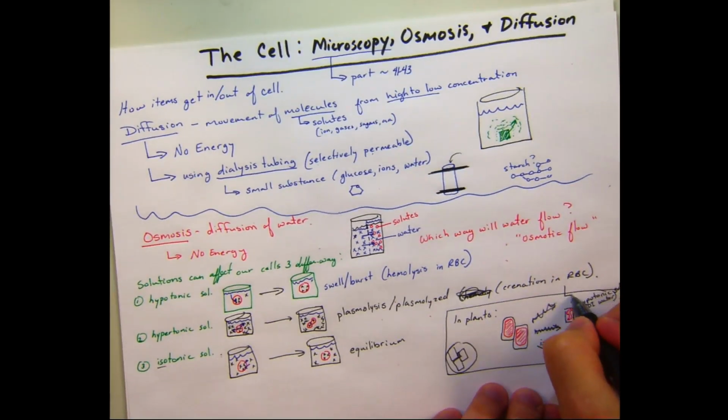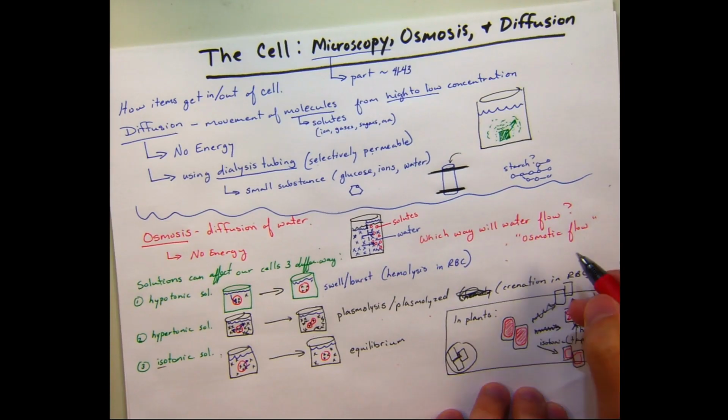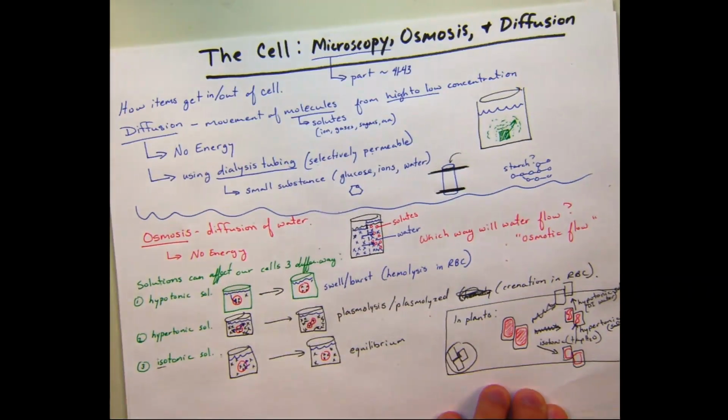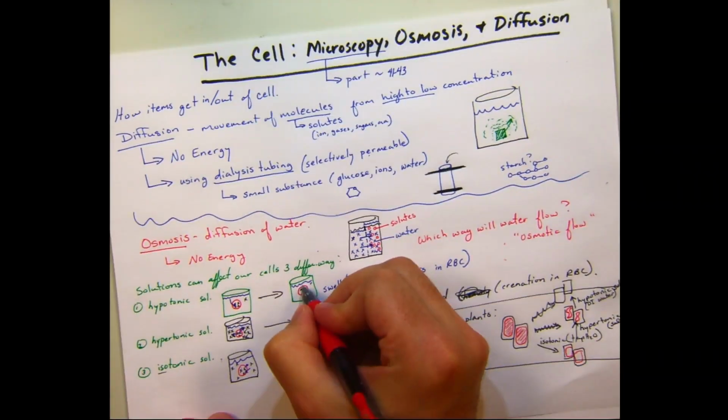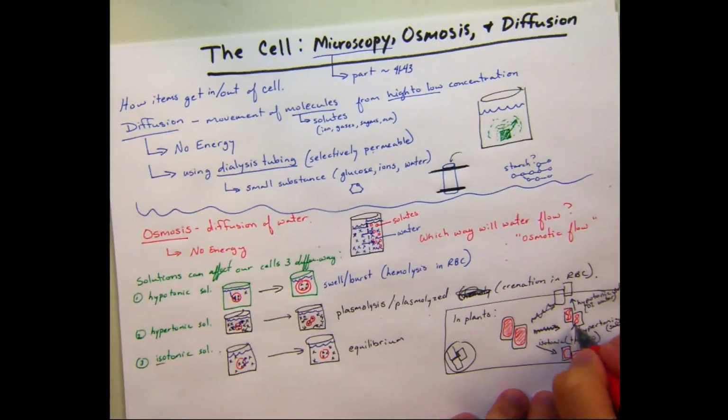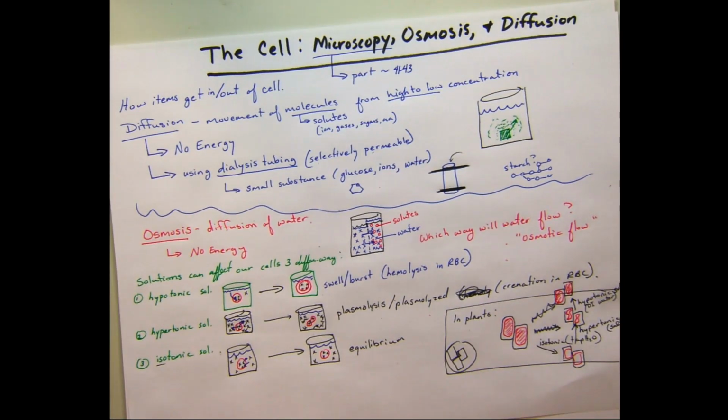What we're going to notice there, and I'm just going to draw from another angle. According to this, water should move into the cell, and that should be shriveled up a little more. Excuse me, should swell up more, and it may burst. But here, the water is going to move back into the cell. So what are we going to see? It should go back to normal, if not more tight against the cell wall. These are things you should observe.